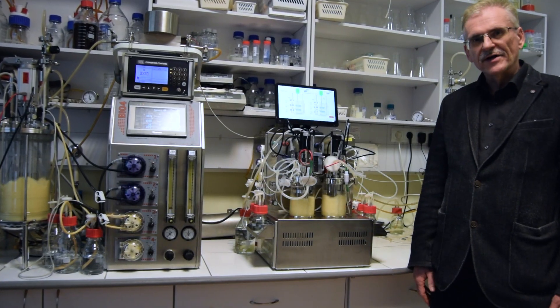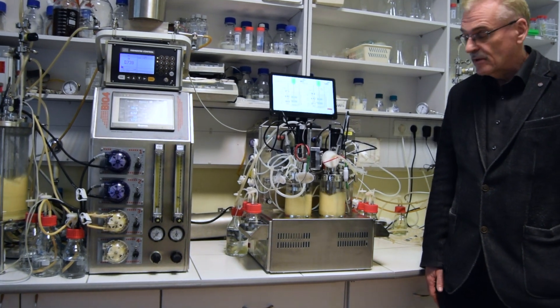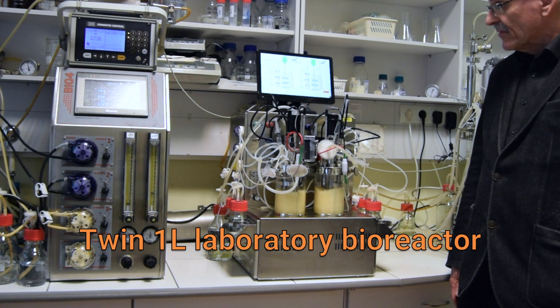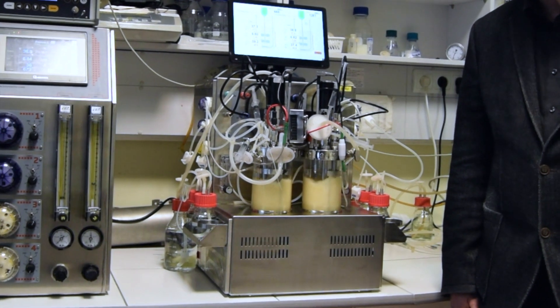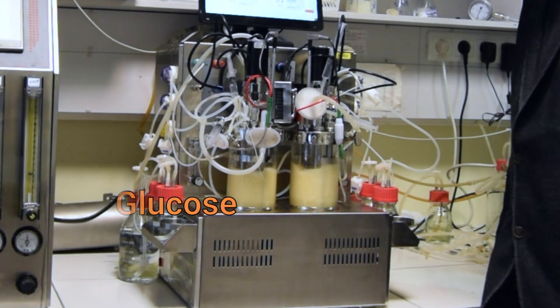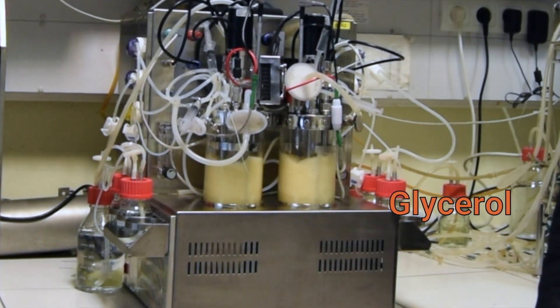Here under testing is a recently developed one liter bioreactor. It is running E. coli parallel fed-batch fermentations. In the left vessel feeding is with glucose, but in the right vessel with glycerol.